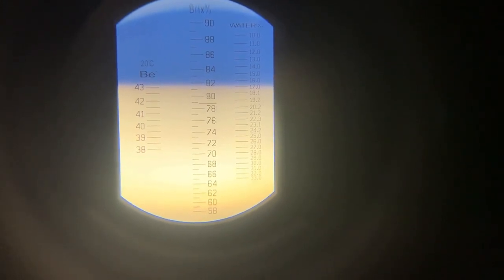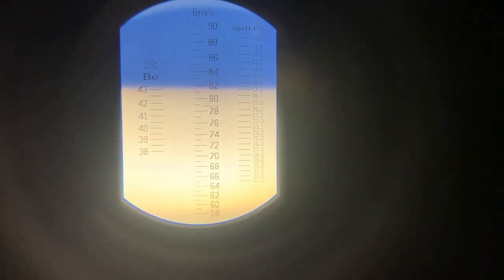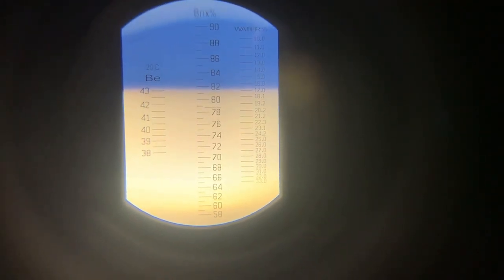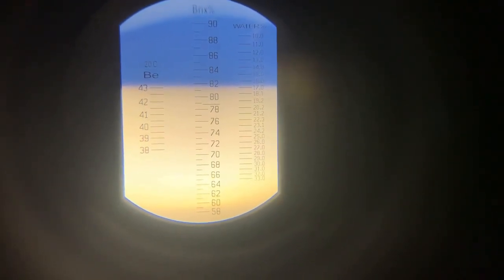If it gets up to 19% or higher, or 18.1% or higher, then yeah, you have some concern. You want to make sure that you either dry out your honey—there's different ways to do that. We won't talk about that on this video. But I wanted to show you what we use to test our honey to ensure that it's the right moisture content so it doesn't ferment or have problems.